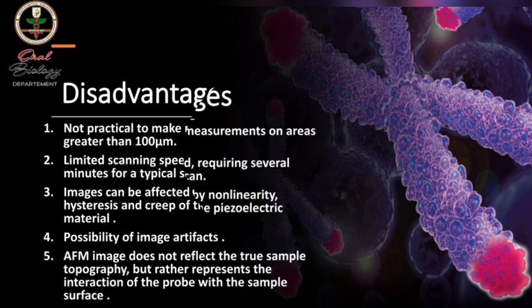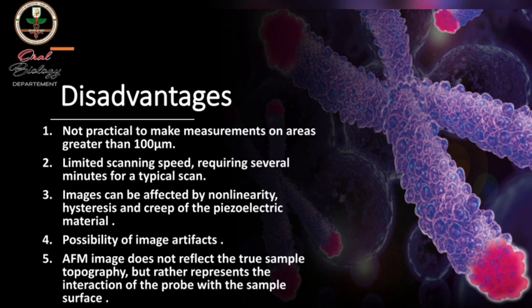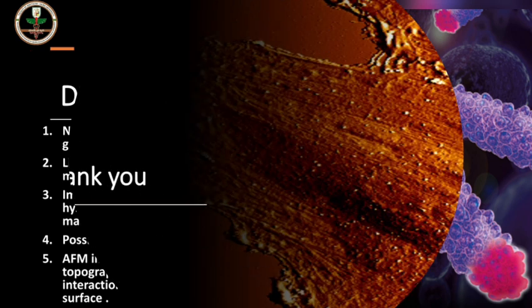And finally, the images produced by atomic force microscopy don't actually reflect the true sample topography, but rather represent the interaction of the probe with the sample surface. And this is one of the greatest disadvantages of this technique.